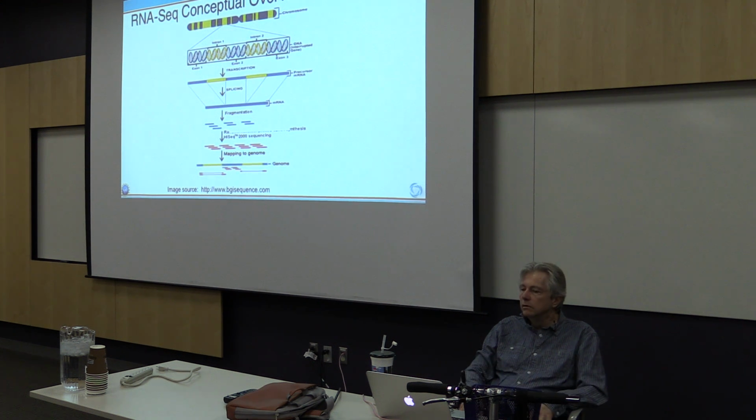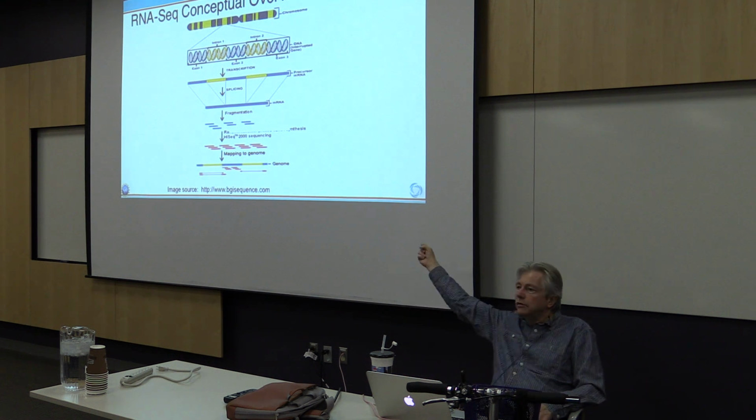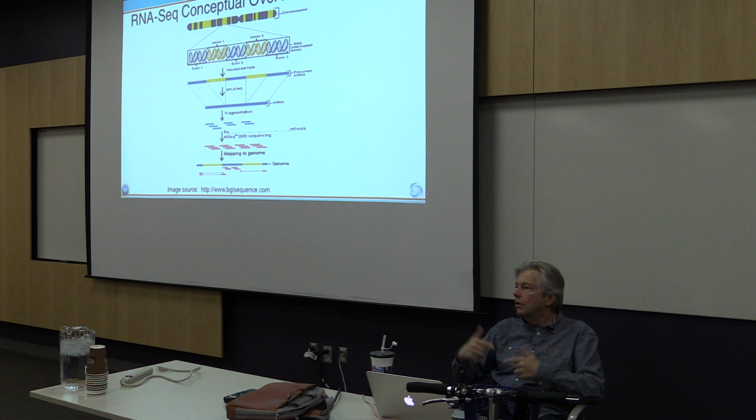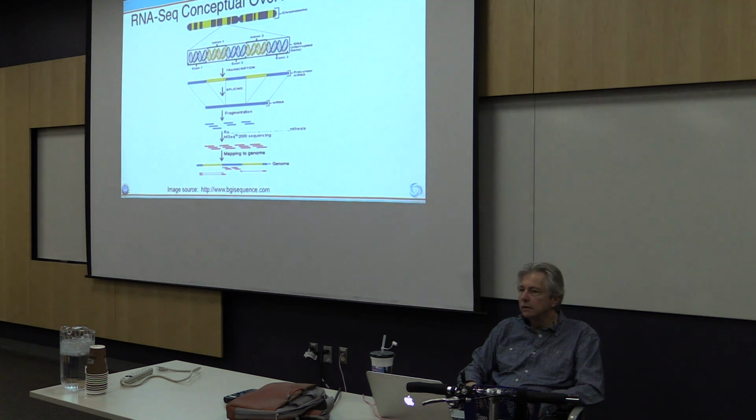Most sequencing systems provide, like the HiSeq 2000, pretty commonly used these days, a lot of data that comes out of that, an Illumina system, that offer the capability of paired reads, because you get your reads coming out as pieces. They're all samples randomly taken, hopefully or theoretically, of your RNA sample that was reverse transcribed.